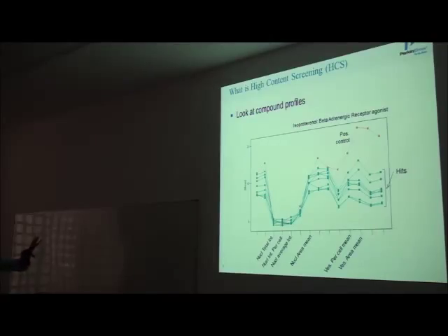And what we have here is the profile of our positive control, the brown one. We look at the behavior of this control, isoproterenol, and here we have, I think, 12 or 14 parameters. Every single point here is one parameter. So we look at the profile of one positive control. Out of these 1,280 compounds, we wanted to know which have a similar behavior to our positive control. This is what we usually call hits, because these compounds can later on become drugs, right? We call them hits.